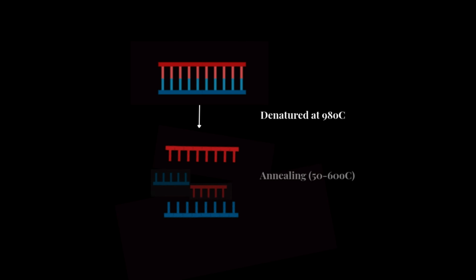A primer is a short sequence of DNA that matches with a particular sequence on your template DNA. So you can think about a primer like a probe. It's supposed to go through your DNA sequence and find where it matches. Remember that your nitrogenous bases, the adenine matches with the thymine, the guanine matches with the cytosine in specific sequences. So your primer probes for the part of your DNA that matches with its own short sequence. It's about 18-20 bases long.